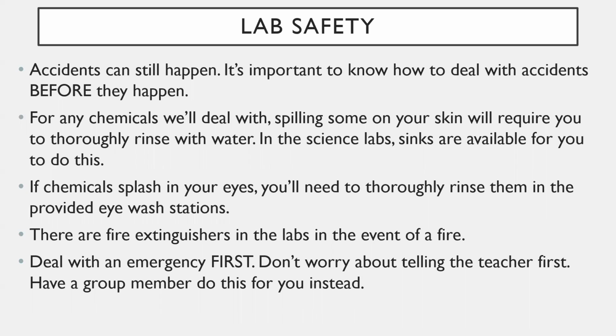So for any chemicals we'll deal with in Science 9, spilling some on your skin will require you to thoroughly rinse with water. We're not going to deal with any chemicals that would require some other kind of chemical or some kind of ointment to solve your problem. Everything we'll deal with will wash off with water. But there will potentially be some labs, hopefully we can have them, where if you spill some of the chemical on your skin, it can cause a burn if you don't treat it ASAP.